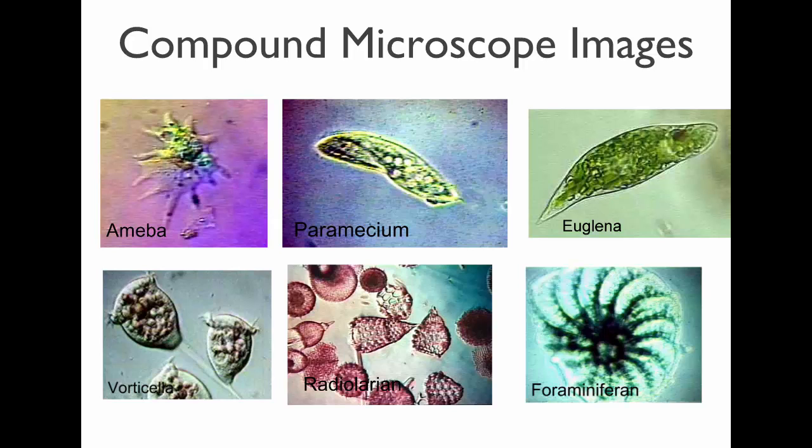Grace? My mom has one of the microscope things, but her lenses are thicker. Thicker? Yeah, they come in all different varieties, and they sell toy microscopes that are smaller, made of plastic. Sometimes you can get them at Toys R Us, and they're sometimes hard to get working well. These are made of metal, and they're a little more durable and a little higher quality, so it's much easier to use that type of microscope.